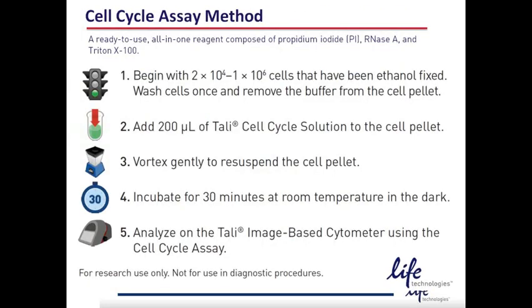We chose to use a method that has already been created in the literature, and keep it as simple as possible with the cell cycle assay with propidium iodide, just your typical steps to stain your cells and then analyze them as you would if you were doing flow cytometry. We're just going to use the image cytometry method instead.